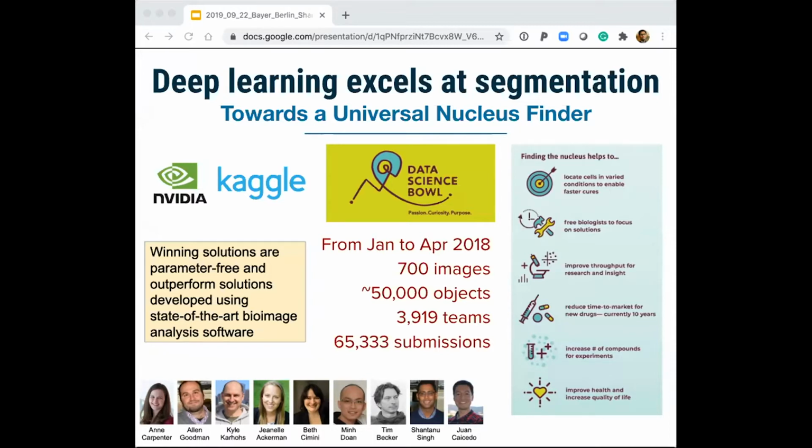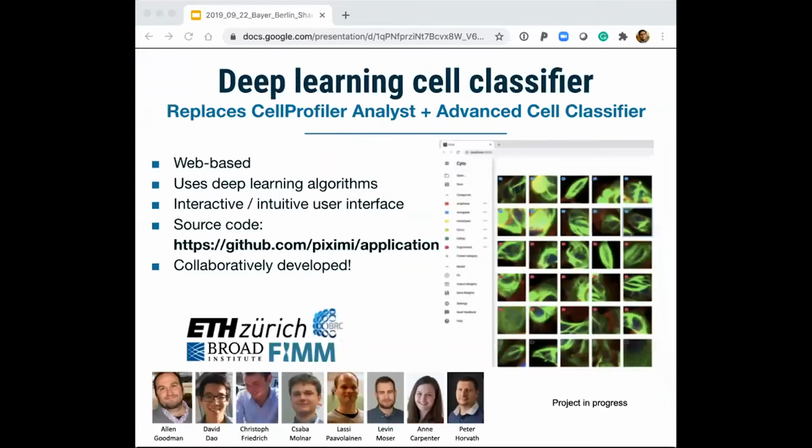And we found that the top performing models were able to outperform, in this wide context, solutions by image analysts, and that suggests that in the near future we may be able to develop fully automated image analysis solutions for some specific yet crucial problems such as identifying nuclei.